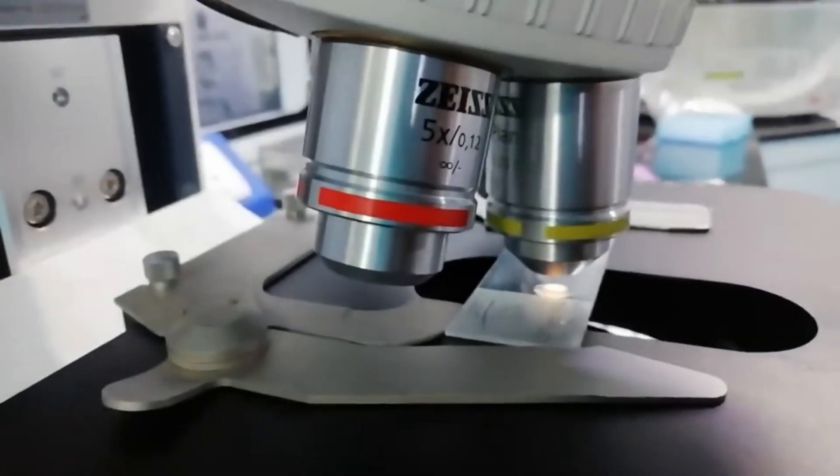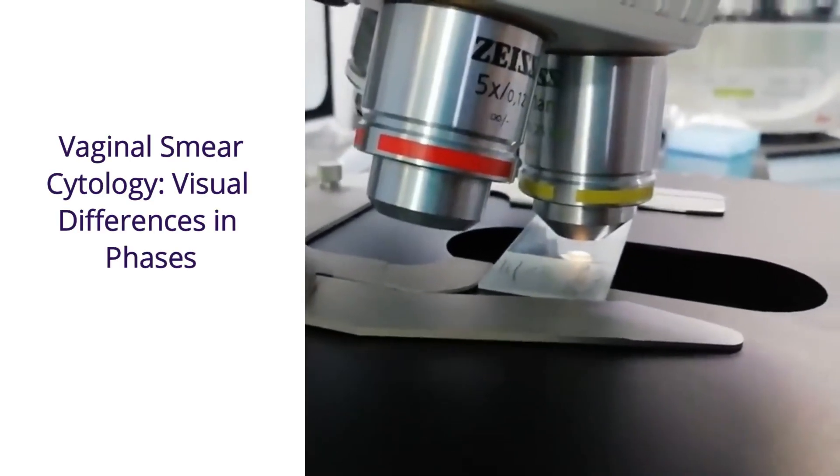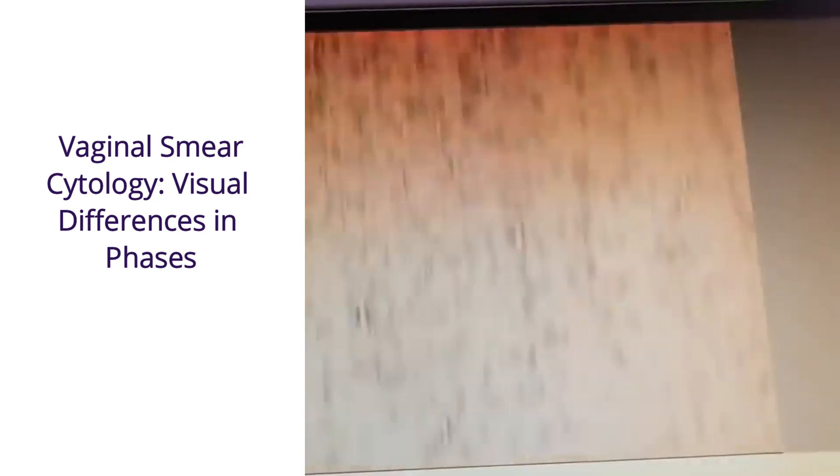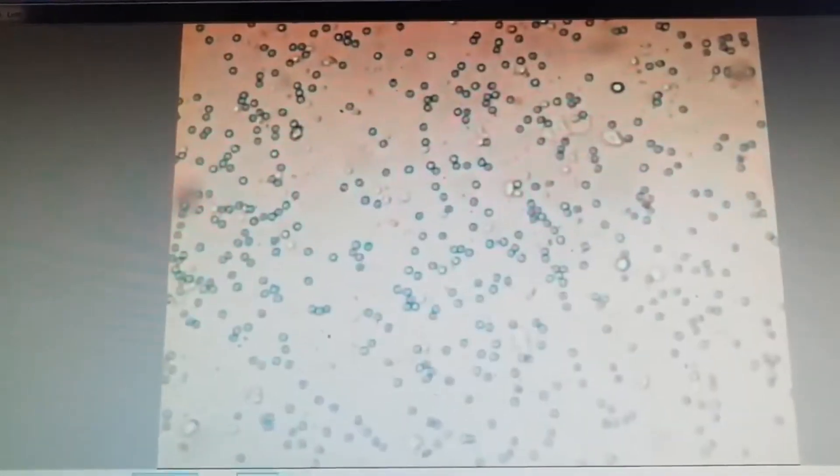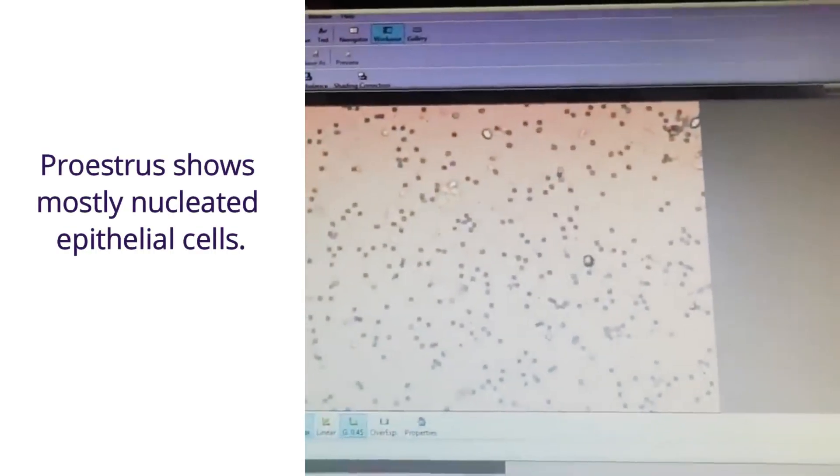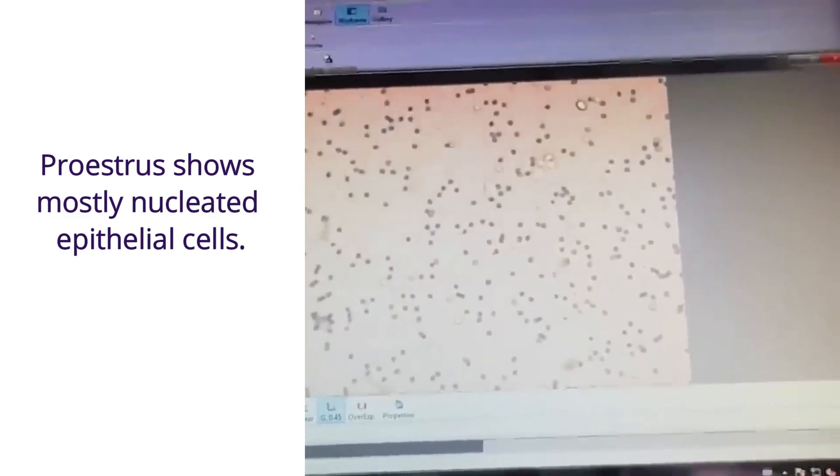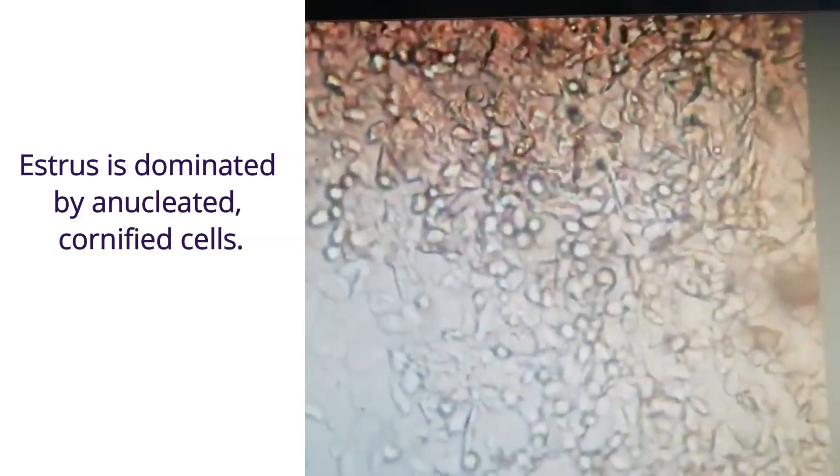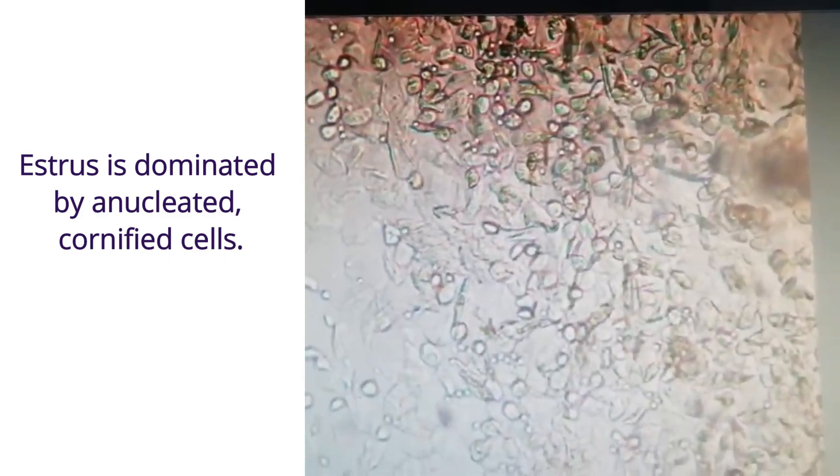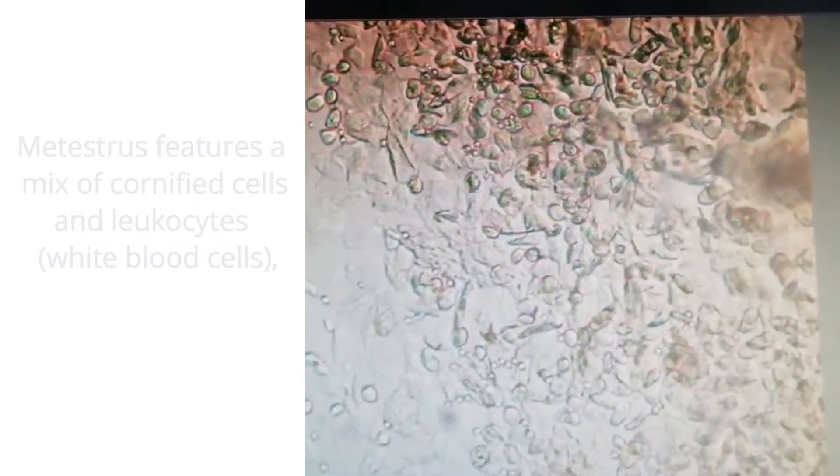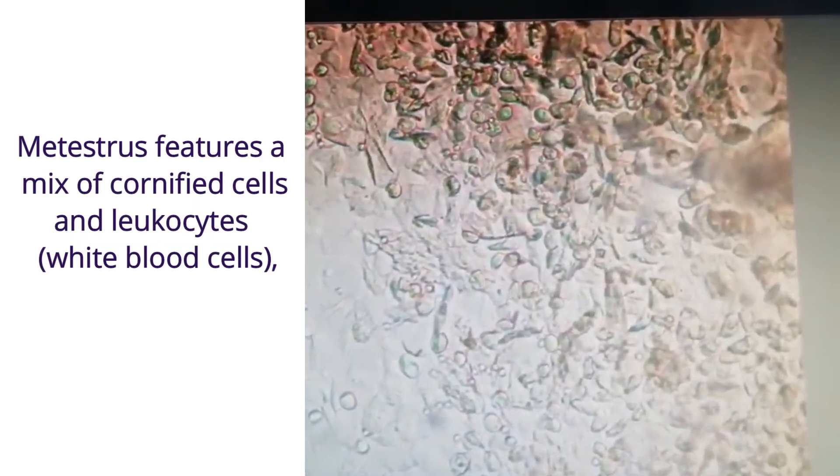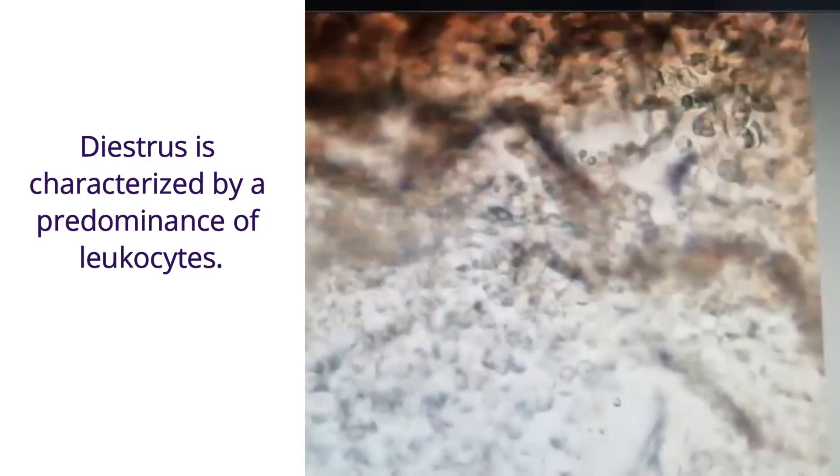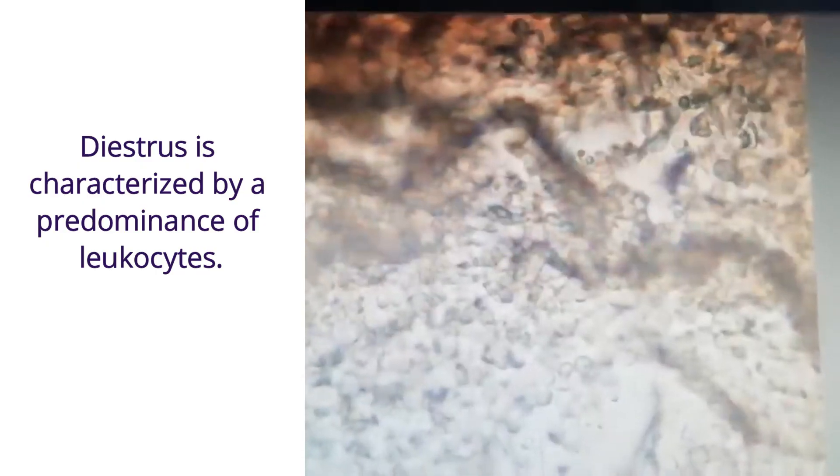Now we will see how we can differentiate the four phases using vaginal smear. Vaginal smear provides a visual way to differentiate the phases of the estrus cycle primarily by observing the types and proportions of cells present. Proestrus shows mostly nucleated epithelial cells. Estrus is dominated by unnucleated and cornified cells. Metestrus features a mix of cornified cells and leukocytes. And diestrus is characterized by predominance of leukocytes.